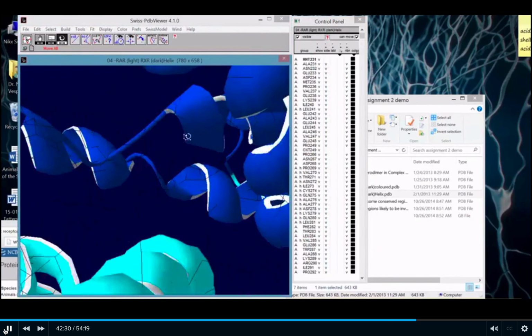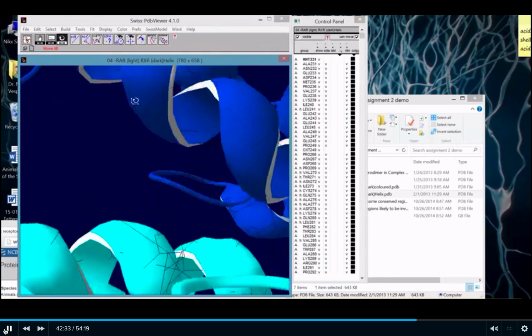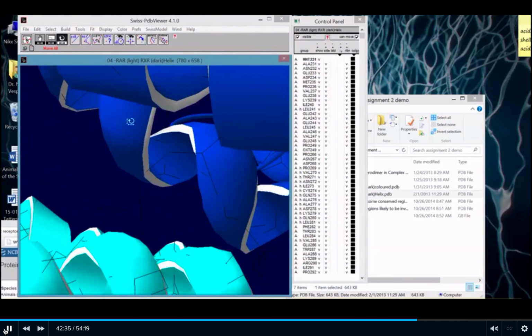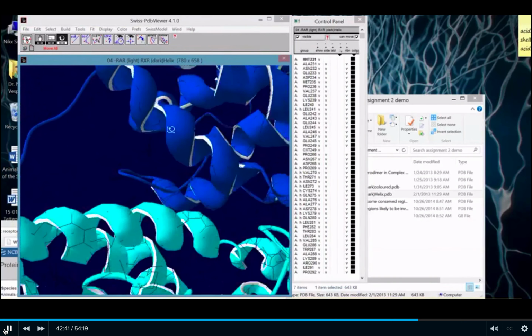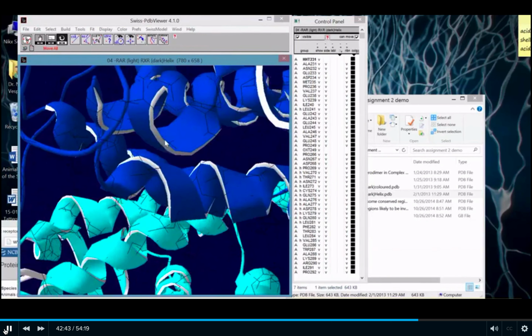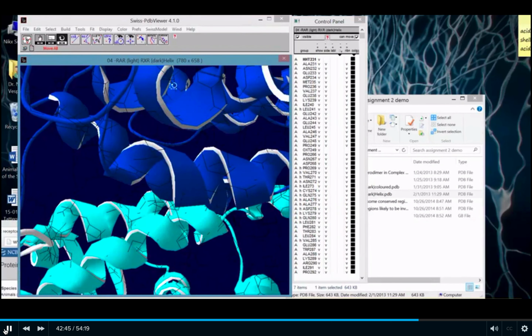It'll depend where your protein is, right? So I've used this one helix here underneath. If I can zoom out a bit, it's probably collided with the helix above it. Or you can at least follow it and see where it's collided with. So the motions you're making are going to have to be very minimal. You can't be all crazy.